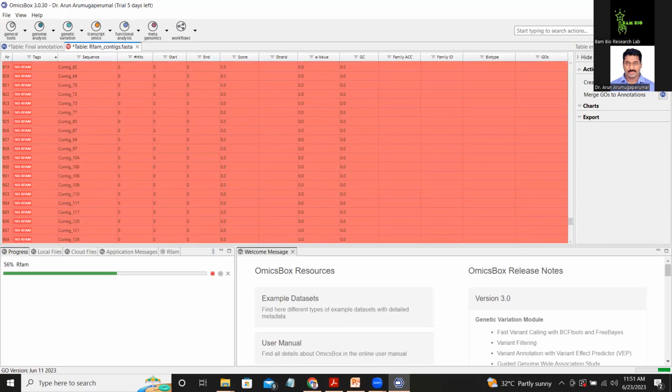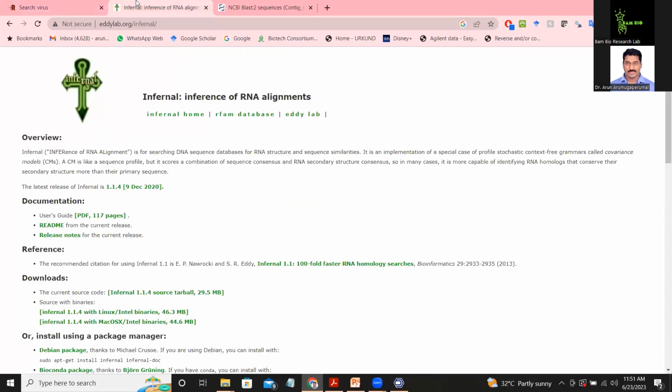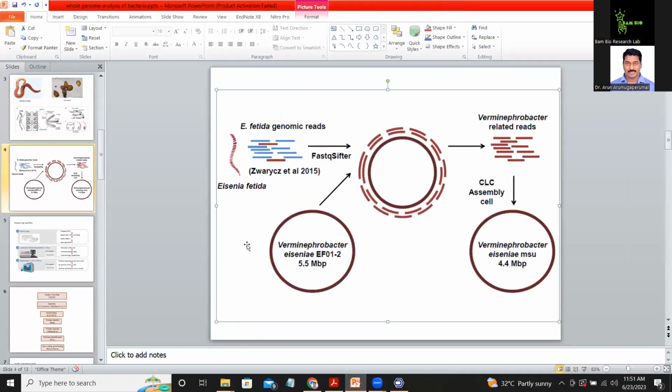Any results here? Okay, no problem. So once you do this kind of analysis, you will get a prediction as to whether some viral DNA or viral RNA is hidden in the genome sequence. By the knowledge of these software tools, you can do your own work on your PC itself. Then you can have a small idea about a very important discovery about the role of that virus in this eukaryotic genome. You can use these tools to initiate a project like that.